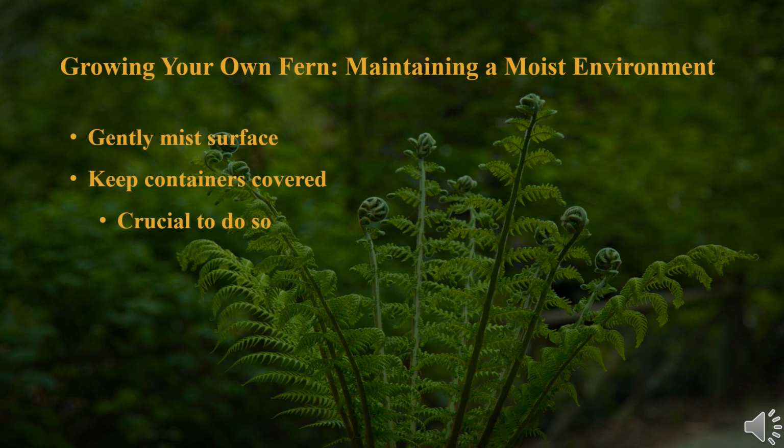Provide and maintain a moist environment. Gently mist the surface, regardless of the media selected. Keep containers covered to ensure a mini greenhouse effect for humidity. This is crucial as spores require a very moist environment in order to germinate.